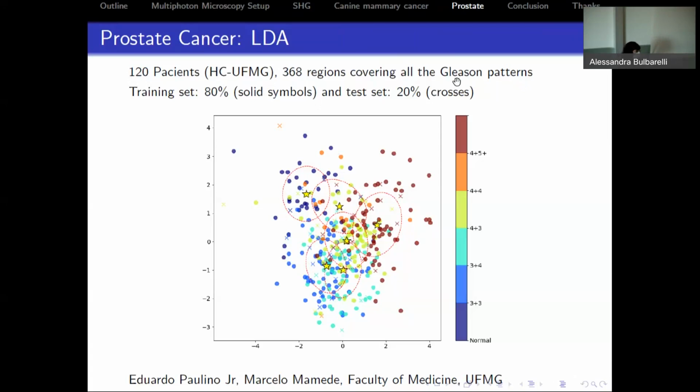And to do the measurement, the pathologist was marking on the biopsy where we should do the second harmonic and fluorescence imaging, but not telling us anything about the diagnosis beforehand. And so we just had the tissue and were told, measure in this area, measure in this area.